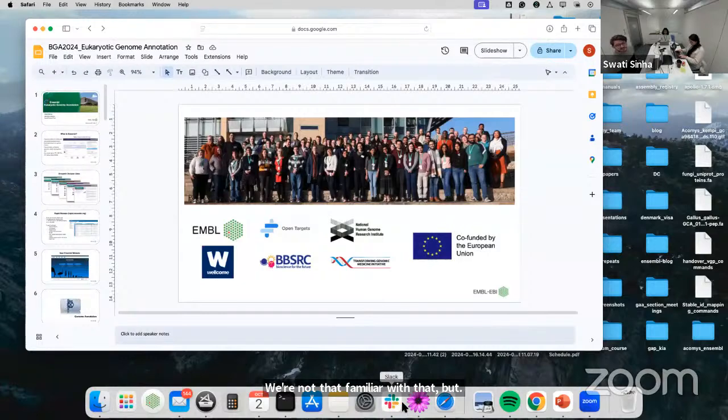So we'll look into this and we can add it to the documentation later. We'll compile every question you make, and even those we can't answer at the moment, we'll try to answer somehow, and we'll share this document with you later. But usually, I can talk a little about it, because if we are using BLAST, we usually rely on what kind of coverage and score we are getting for that particular gene.